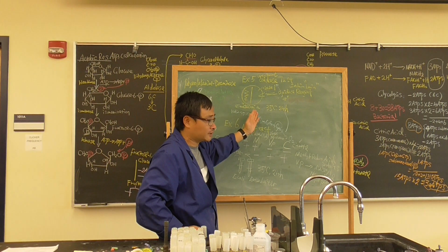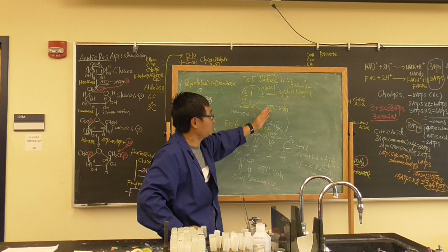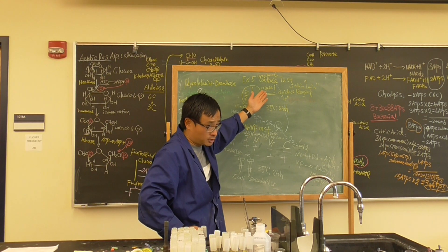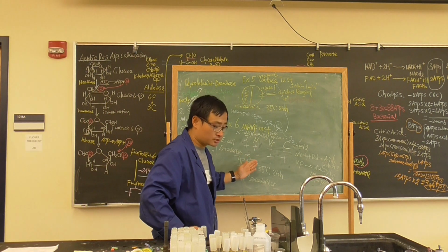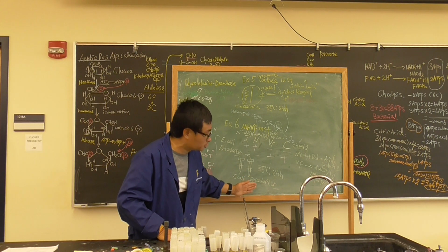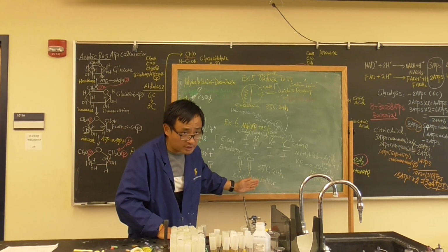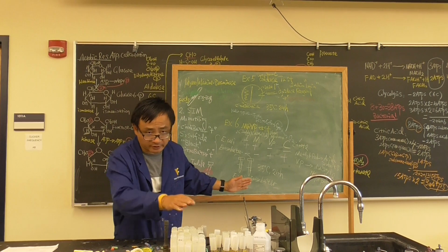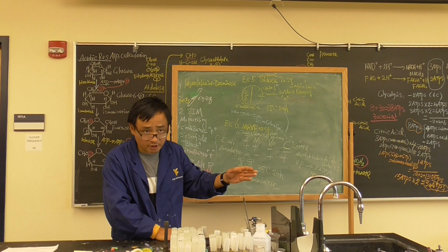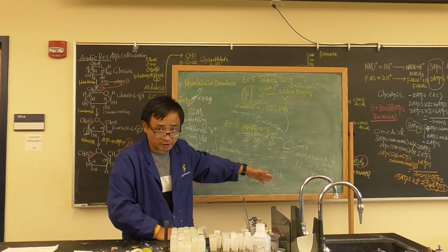Left side is Citrobacter, right side you pick whatever you like. Label it very well, and we'll do the incubation. The confirmation test is next week Tuesday. And for the VP test, grab one tube. If you do E. coli, your bench partner does Enterobacter. Just add the bacteria using a loop from the slants, and we'll do the incubation. This confirmation test we're also going to do next week Tuesday.